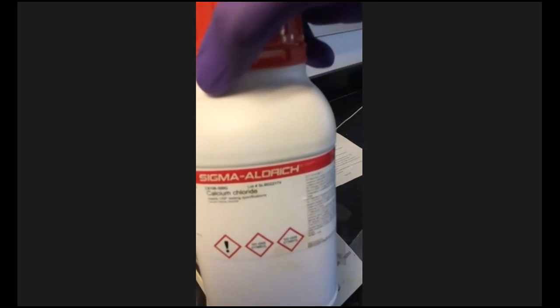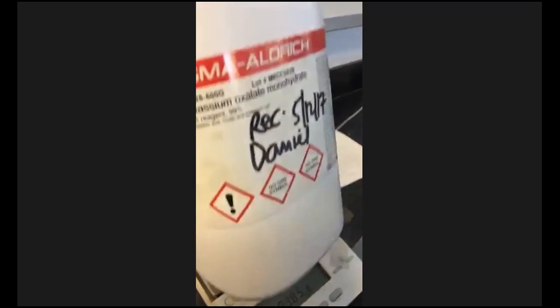1.2. All right, so we're good. 1.2 grams is the mass of your salt mixture. And that salt contains both calcium chloride, which is here, and potassium oxalate. I want you to write these numbers down too.